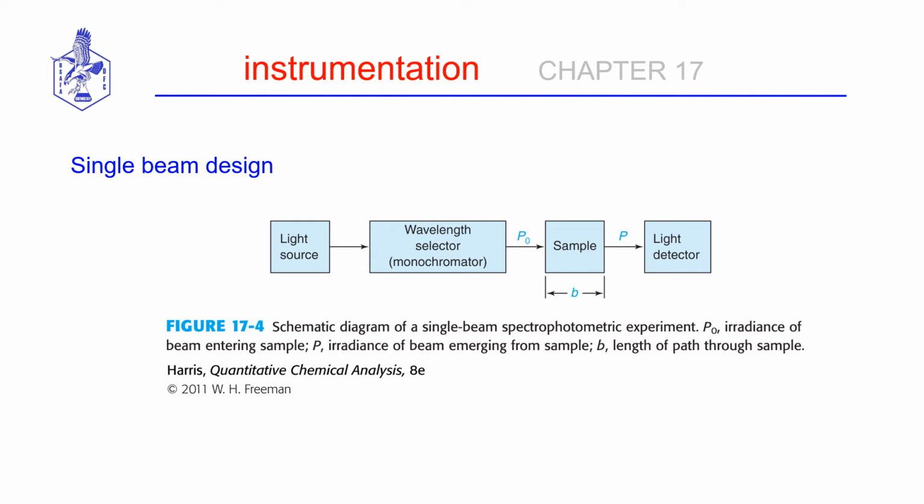The second area we want to focus on with our UV visible absorption methods is the instrument and the components within the instrument. You are looking at what we call a block diagram of the instrument. The most simple design is for us to start with a light source. We must have some source of the UV and visible light that we are going to irradiate our sample with.